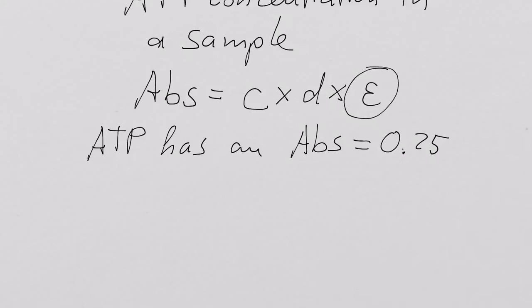But I tell you what, my supervisor really needs to know what the concentration of this ATP solution is. What can I do? Any creative ideas? What can I do? Yes? Concentration curve. A concentration curve. I like your idea. What is a concentration curve? You're basically now my supervisor. You tell me what you mean.